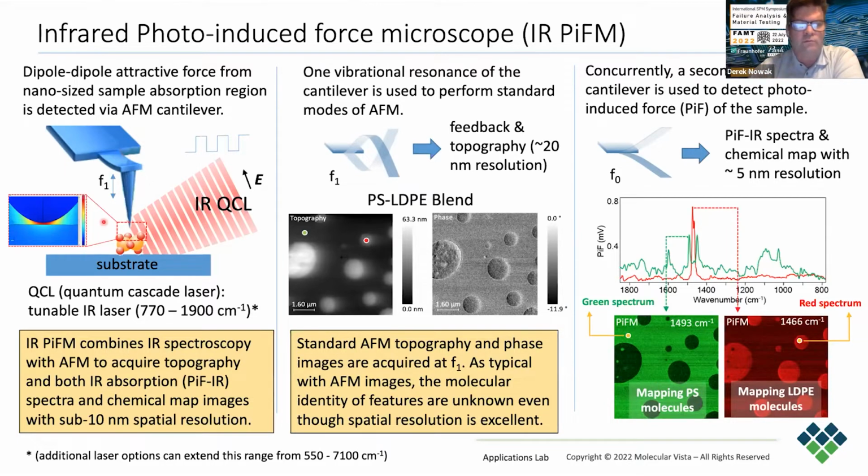And so you think of it in the same way you do van der Waals forces, which are also a dipole-dipole interaction. As you get closer to the sample, you get this attractive regime, and then you go into this repulsive regime. We'll be seeing a similar effect, but now on top of that van der Waals, we'll be having this sample absorption interaction with the light.